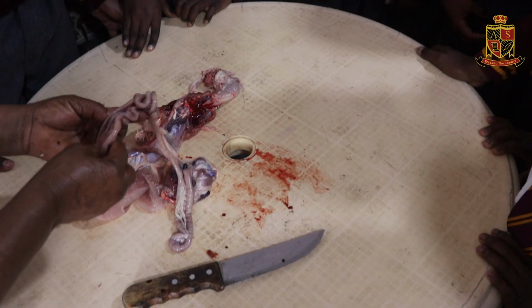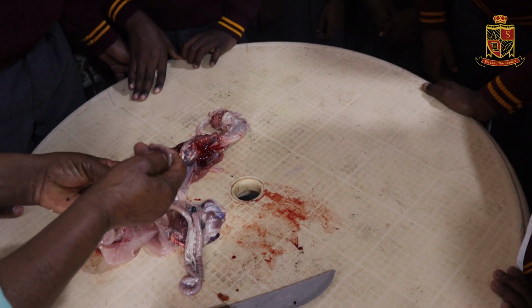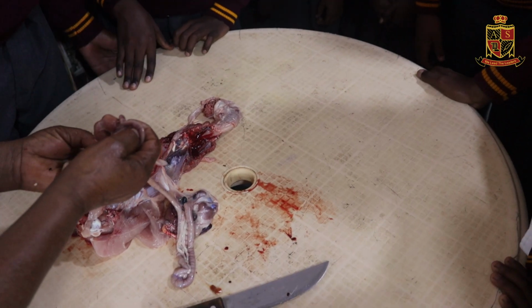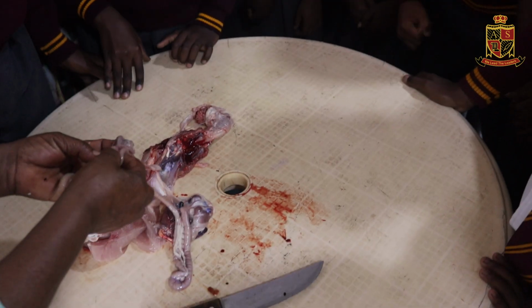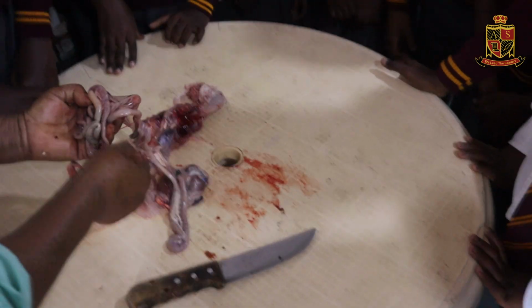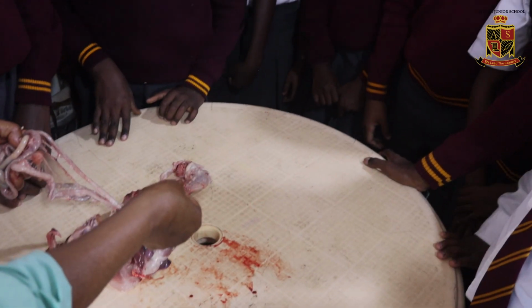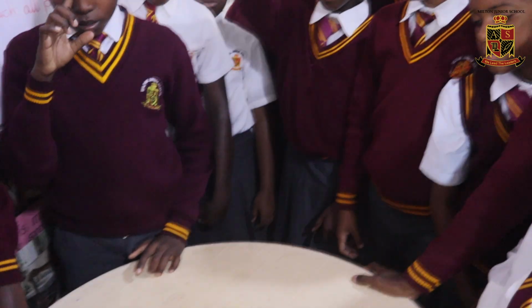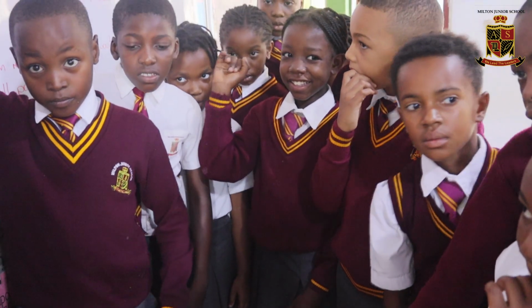Yes, and then it will be distributed to the parts of the body, especially in our blood, isn't it? Yes, especially in the blood. And in the large intestine, yes, Tinashe?